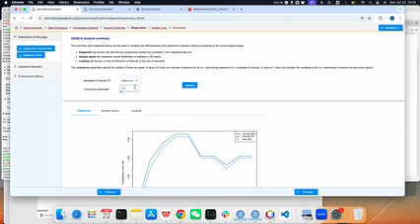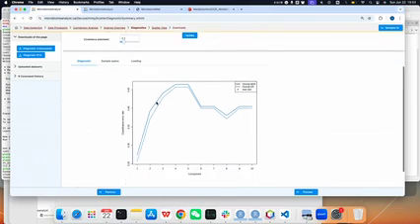And here we use the default, 0.2, which is a recommended value from the original group that developed this method. So we just keep it like this. And here we also see the diagnostic result. It says the cluster error increases until the 5th component.